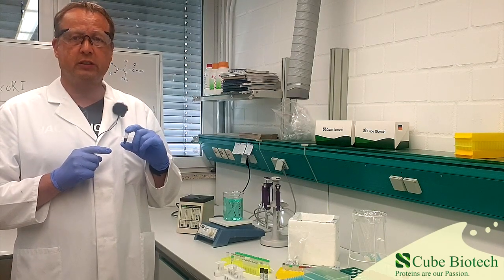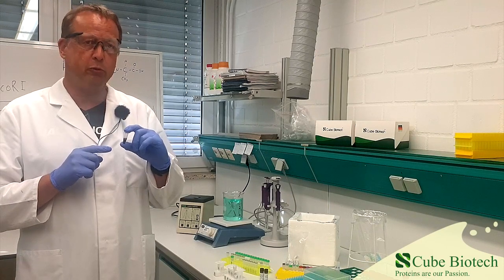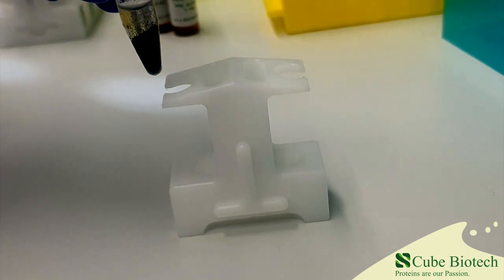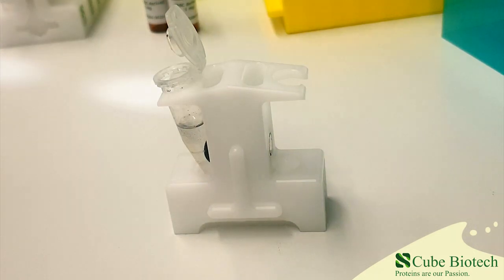It is time to separate the MAC beads — and through that the GFP — from the rest of the lysate. As you can already see, the lysate has lost most of its green color. This already shows you by naked eye that the purification was successful.